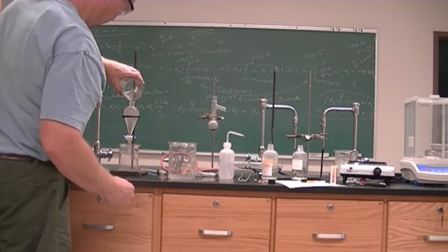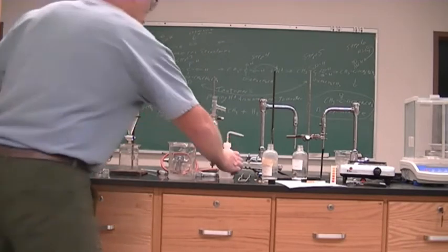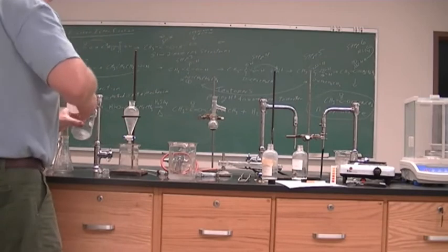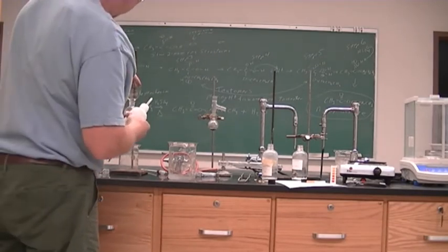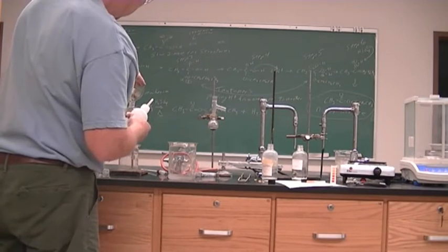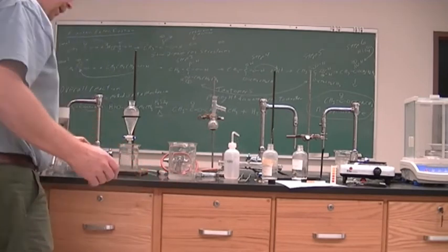Alright, so much less solid this time. And we're using some more deionized water to make sure we get it all in there. Alright, give it some time to separate.